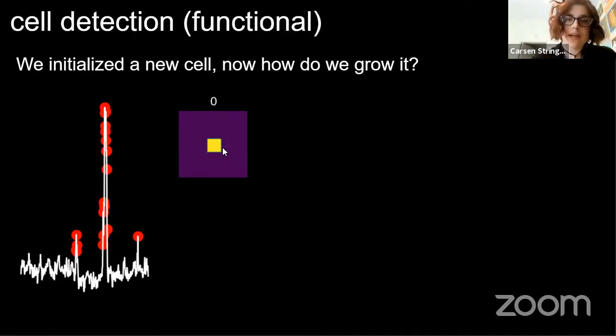So basically we have our patch. We are starting with this 12 by 12 that we found the peak was in that map. We're going to see what kind of activity this little square has across time, and this is what the activity looks like across time. And we set a threshold, which the user can change, which basically says which frames we should focus on, which are big enough deviations from the average activity that will correspond to actual events rather than what might look like noise.